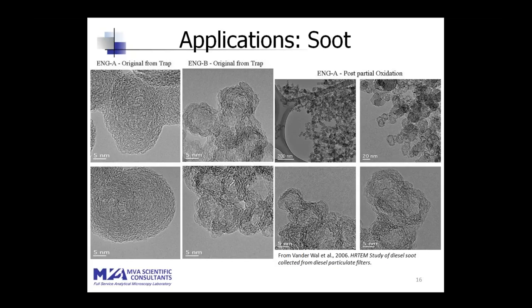In the initial images from engine A, those circular concentric particles appear more robust. They're more filled in, but not quite as well ordered as what you do see in the image B soot particulate. In engine B, these soot particulates feature an interior void.